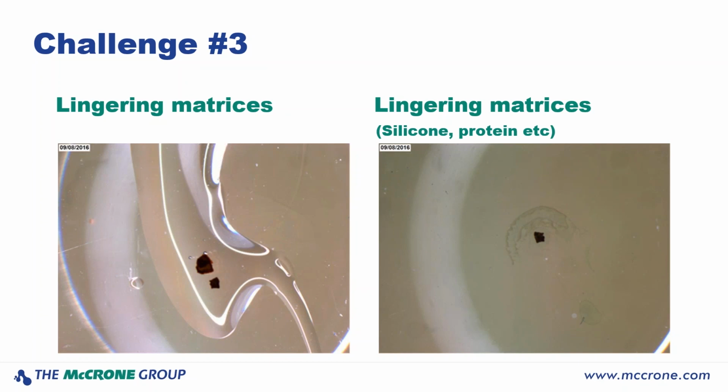If you get a particle that has been previously isolated from a liquid matrix and you don't have it available to dry down and examine, it's really important to find out what that was and what it might be, because then you can determine the appropriate solvent to get rid of it. We like to start with water because we want to preserve it. We don't want to risk dissolving our particle, but in the case of silicone, that's not going to take everything off. So as much information as you can have about where a particle originated, the better off you're going to be. It will guide what you're going to do to prepare it to give you the cleanest analysis possible.